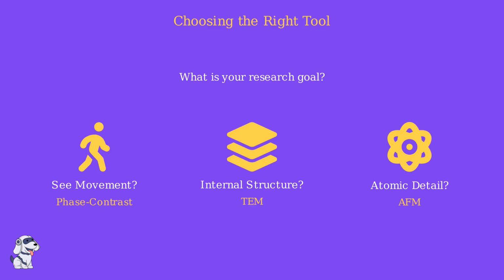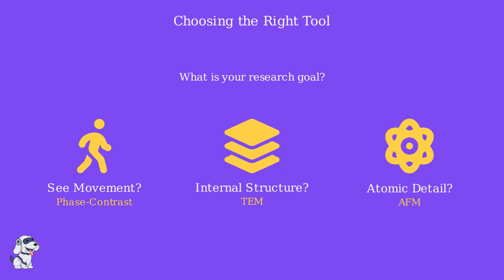And when your research demands resolution at the atomic level, the Atomic Force Microscope allows us to measure surfaces with unparalleled precision. Each instrument offers a unique perspective. In modern science, matching the right technology to the task is the key to discovery.